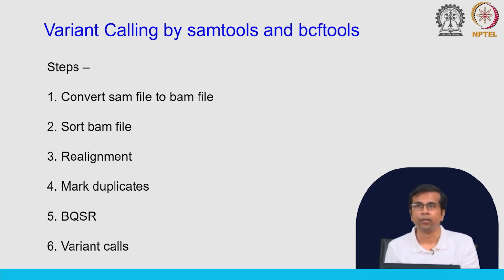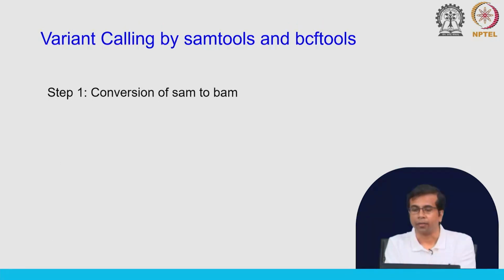Okay. So, one of the things you should notice is that when we install SAMtools, etc., you might end up with some issues with some libraries. Okay. So, you would have to install them independently. Okay. For installing SAMtools and BCFtools, you have to again rely on the install instructions that are there. So, I can go and show you these install files that mention the step-by-step installation process. Okay. I will show that, and then we will start with the conversion of SAM to BAM.